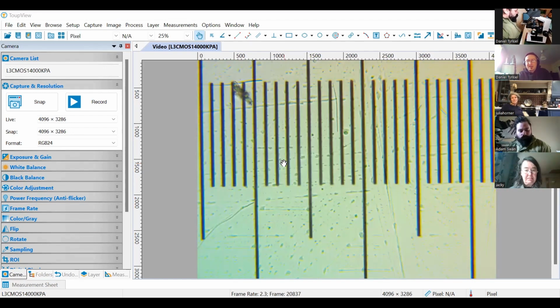So it's a very useful tool actually for learning to assess the width of fungal hyphae, because the spreadsheet, or the software Dr. Ingham is using, basically allows you to put in the width of the hyphae, because the width of the hyphae gives you the diameter of the hyphae as a circle, and then the length basically times that circle. Now that's a cylinder. So we're actually having to measure the volume of the cylinder of that hyphae, and then times that by a known. This is just a calibration slide. This is what you're looking at.